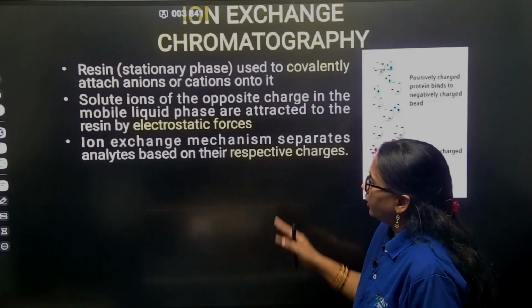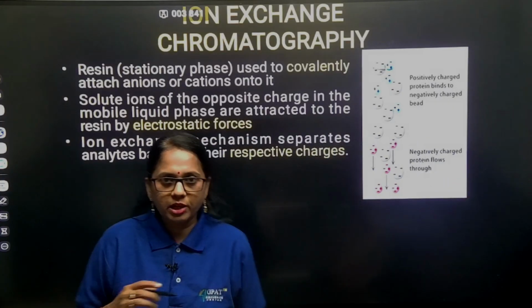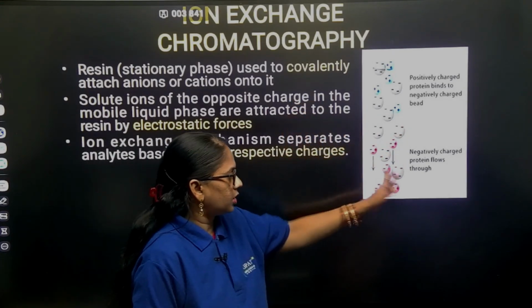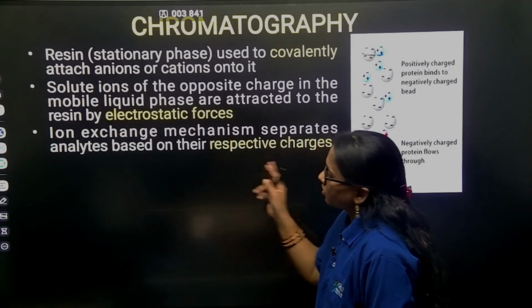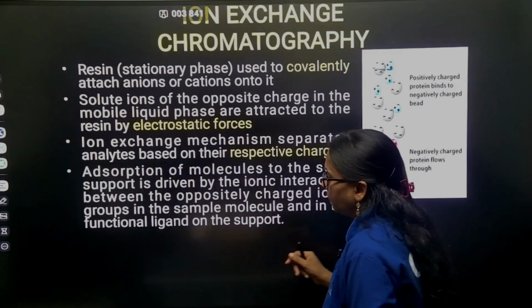This ion exchange mechanism is based on the respective charges. A positive charge binds to a negative charge. So the separation is based on the respective charges present, and the electrostatic forces play a very important role.